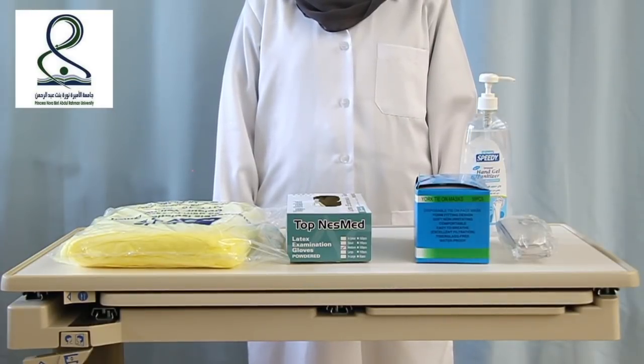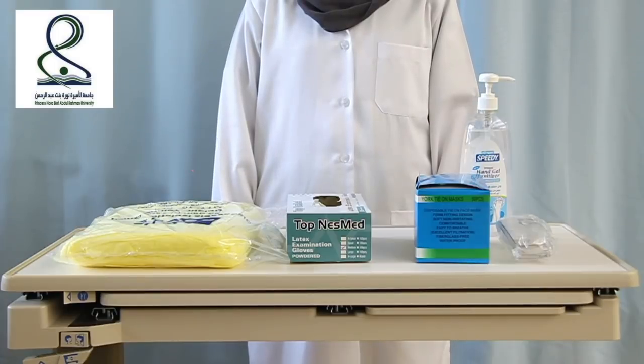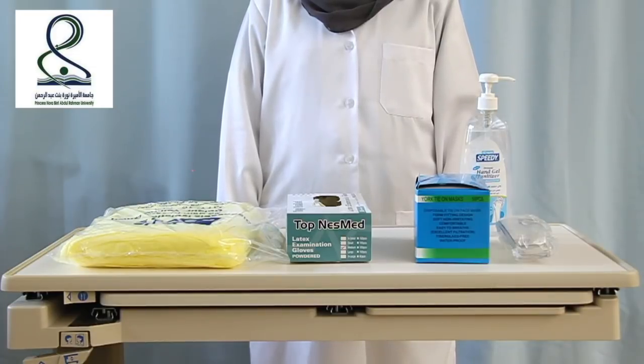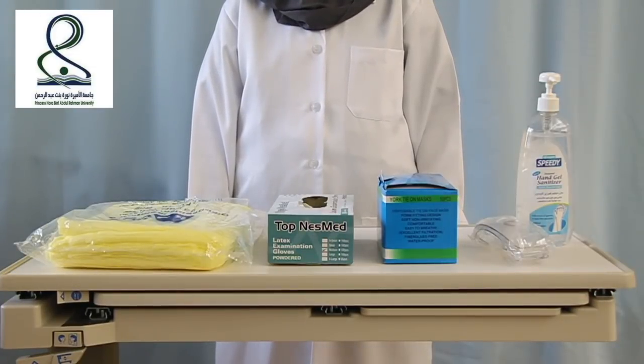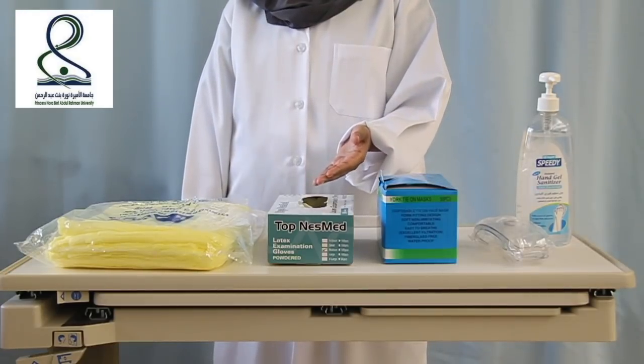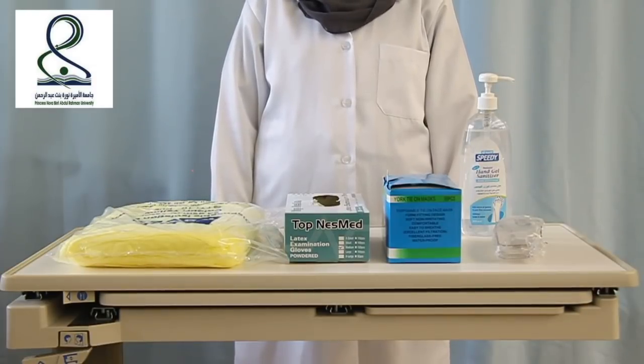Hello everyone, we are nursing students at Princess New University. Today we are going to do a PPE procedure. In PPE we need hand gel, goggles, mask, gloves, and gown. PPE stands for personal protective equipment.